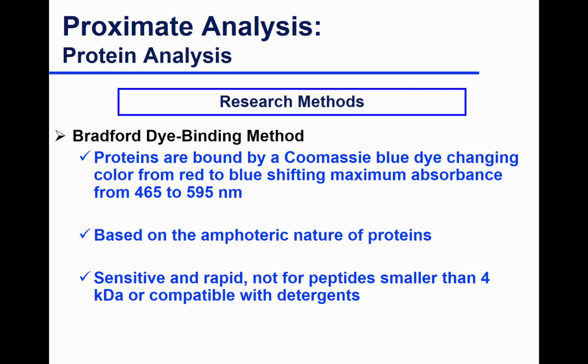I also would be guessing if you had peptides versus intact proteins, Bradford would not be your best option. Whenever you're looking at different types of proteins, you want to be careful about measuring them using Bradford.